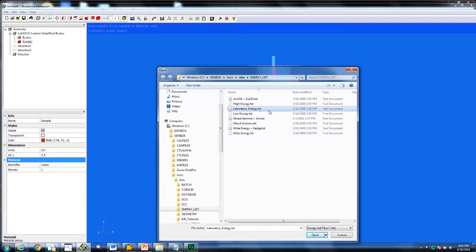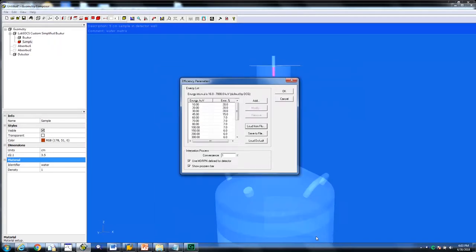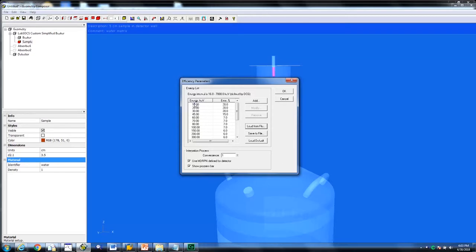We have chosen laboratoryenergy.txt. Since the detector characterization for the well detector is valid from 16 keV to 7 MeV, we will remove the 10 keV energy from the energy list. Select 10 keV from the list and click remove.